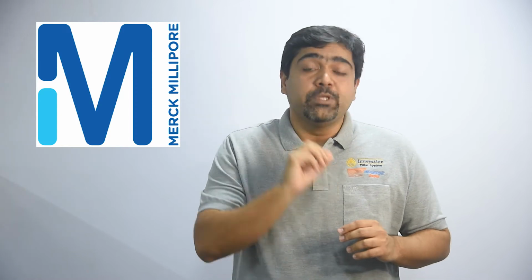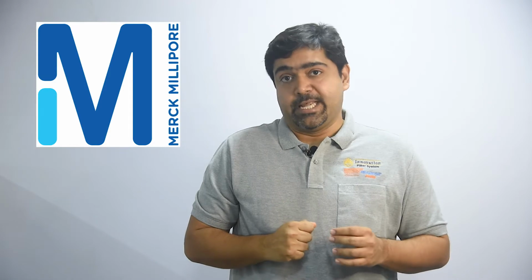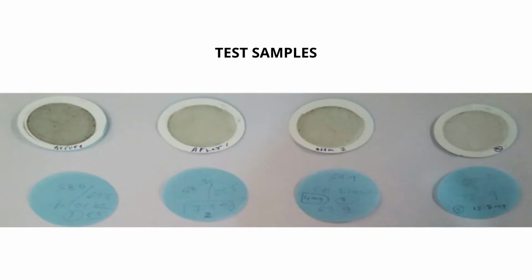in the process fluid. Interestingly, Millipore is not the actual name of the test. It is the name of the company which makes the filter media which are used in performing these tests. These filter media are in the form of flat discs which have controlled and known porosity which traps these solid impurities. Now let's try to understand why exactly is Millipore testing necessary.